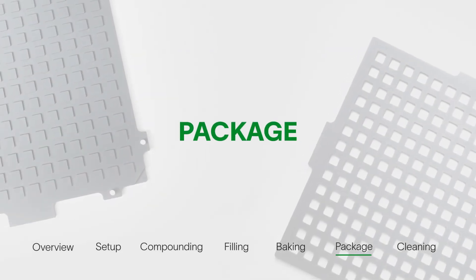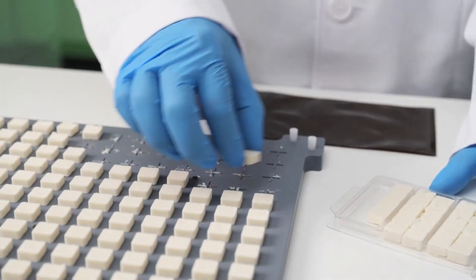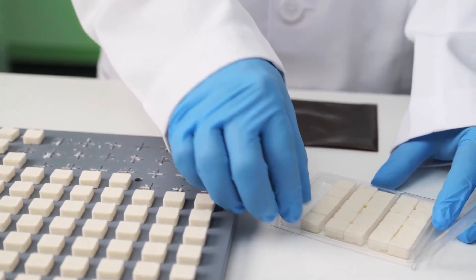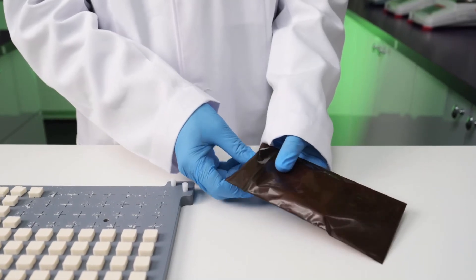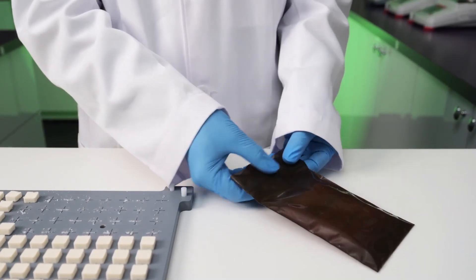Now it's time to package. The Medi-X Tab mold has accompanying blister packs available that are handheld, easy to use, hold up to 30 RDTs, and come with a UV resistant bag.